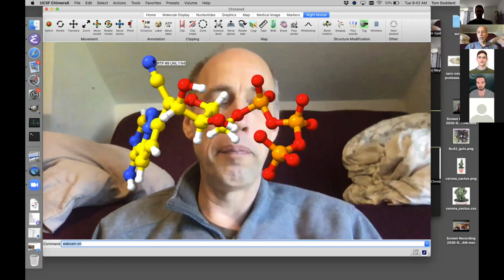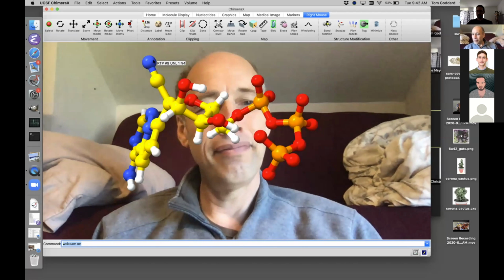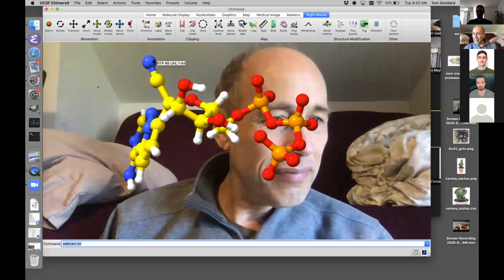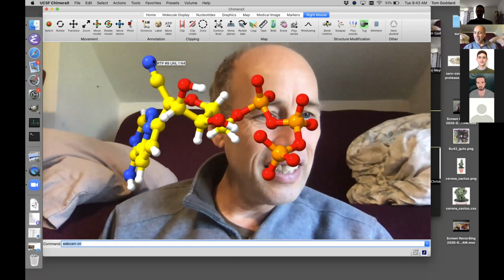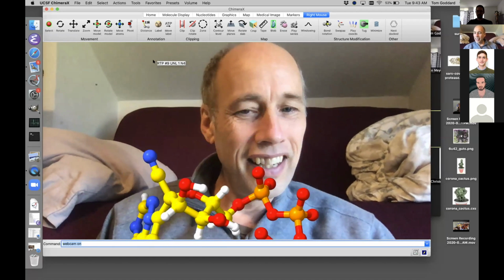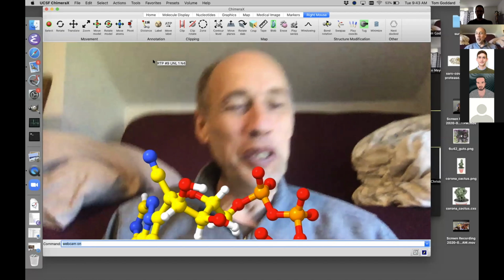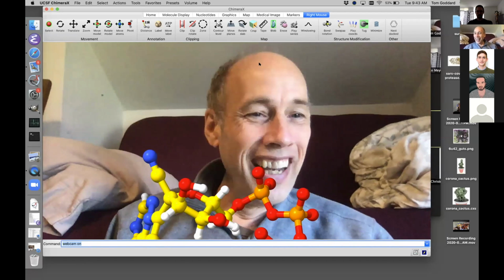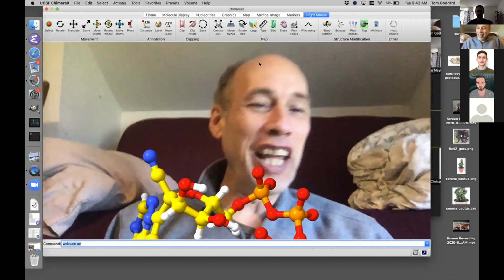Are there other questions? That's great, Tom. I was wondering, this is Jason Key, that's pretty good. Have you experimented, this seems really new, so this is maybe just a future thing, have you experimented with offsetting the center of rotation and then the video center so that they don't land right on your face? Like if it was spinning here, I don't know if you can see my video. It would be a little easier.